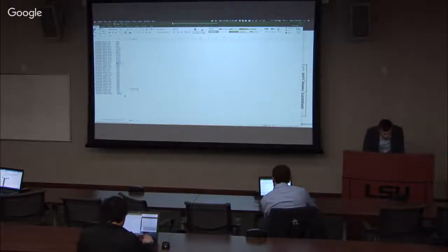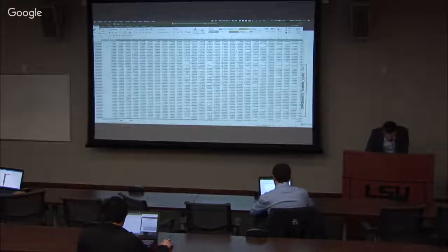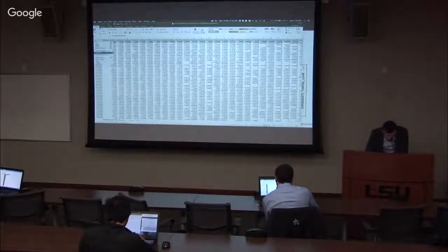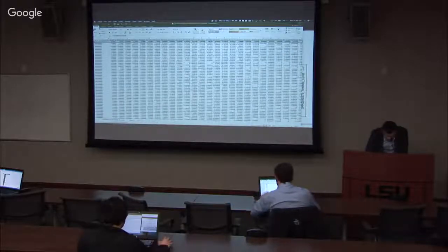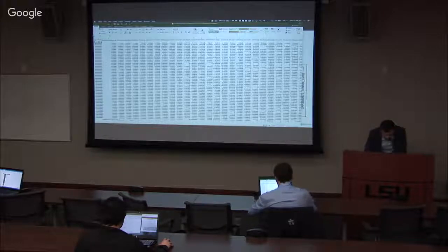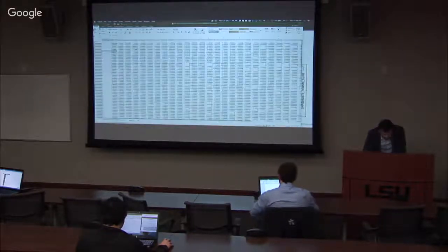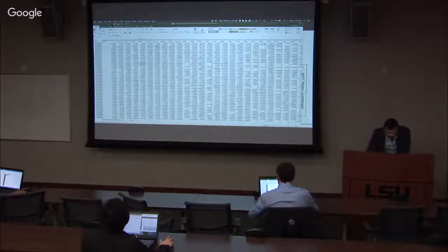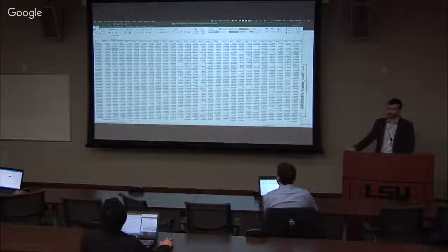So now what I want to do is, first of all, go back and sort this to how it was. And then I want to take this column, go in here, insert a row first. And now I'll call this class. And just transpose. Okay, so now I've annotated these and created a training data set that will tell the machine what I'm looking for.